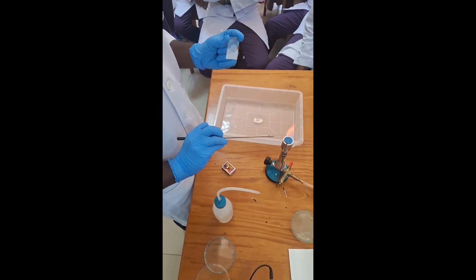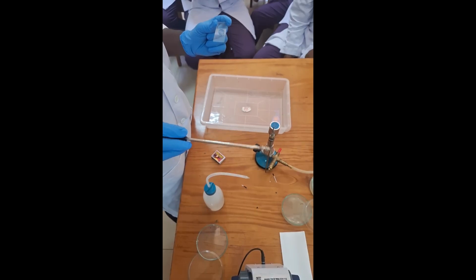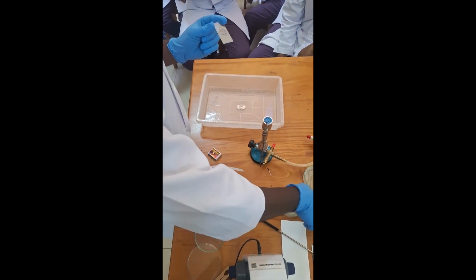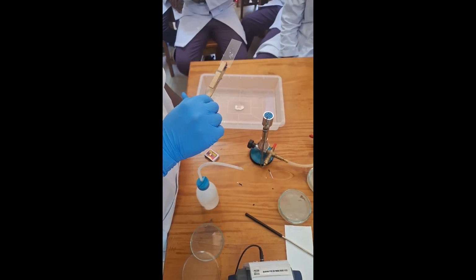Allow the smear to air dry completely. Heat fix by passing the slide through a Bunsen burner flame 3 times.